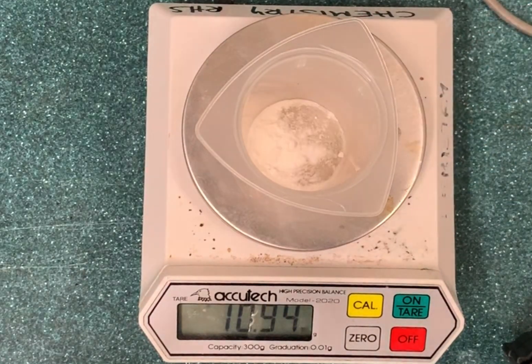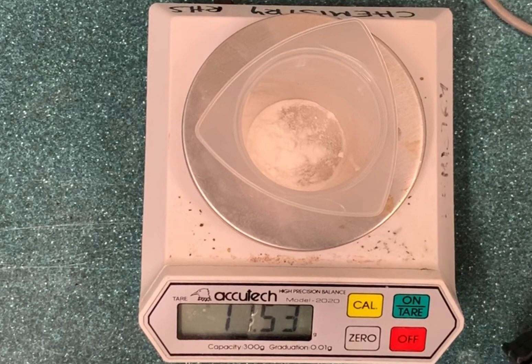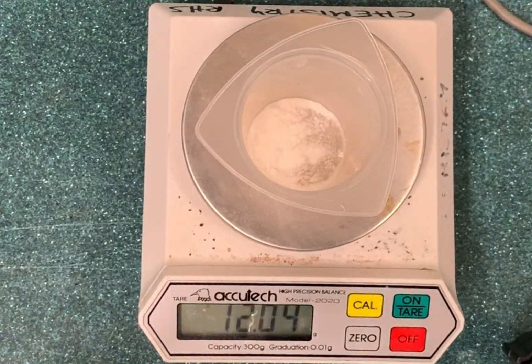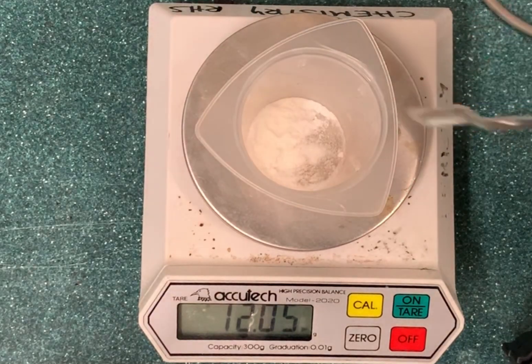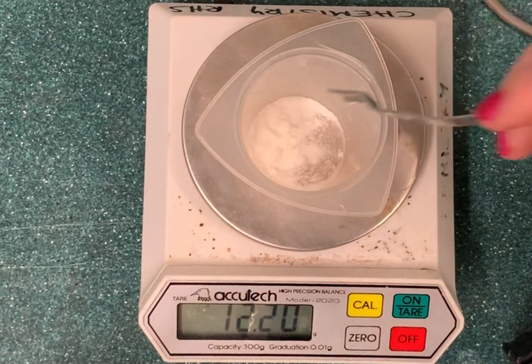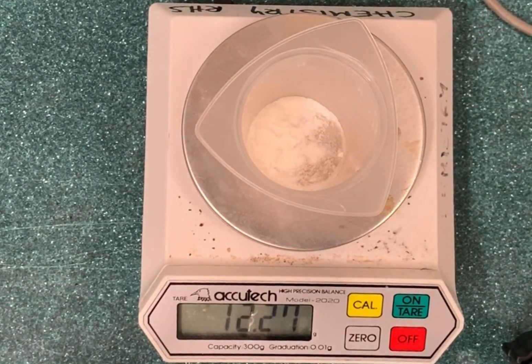This method is also useful if you want to know how much solid you've produced. For example, in a round bottom flask, you would know the weight of the round bottom flask at the start of the reaction, and then you can weigh it at the end with your product inside — that way you can find out exactly how much product you've made.